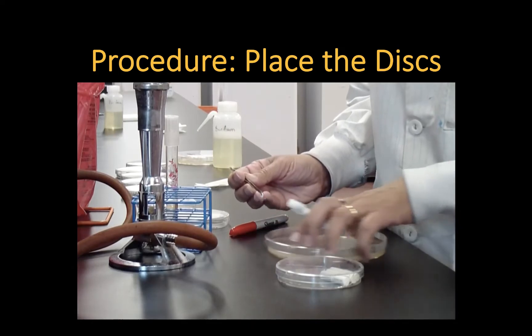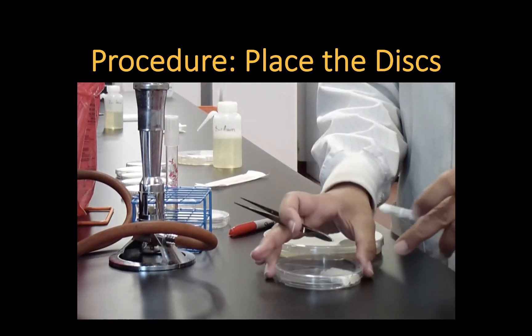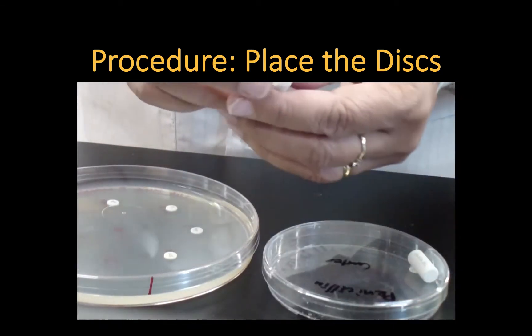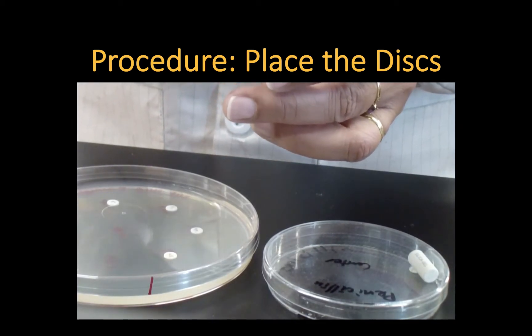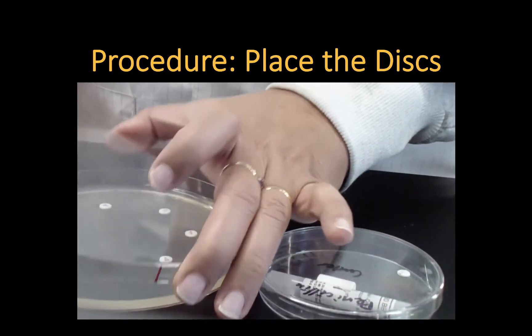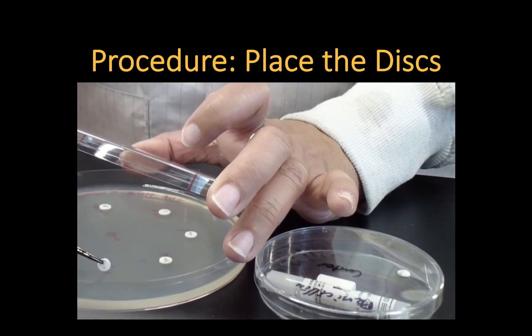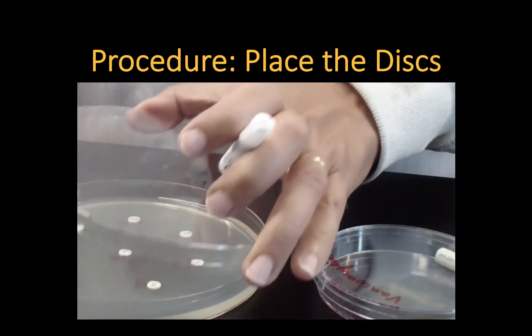Then put the disk on the dots that you've marked ahead of time on the bottom of the plate. Lay the disk flat and tap it lightly with the sterile forceps to ensure that it sticks to the medium.